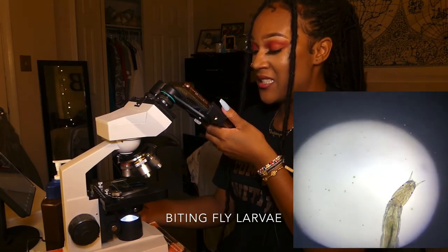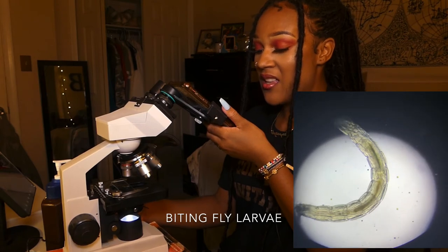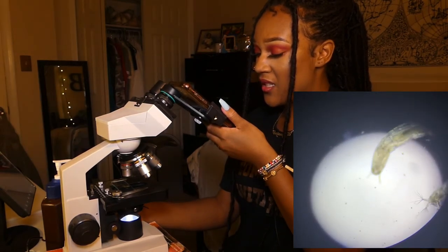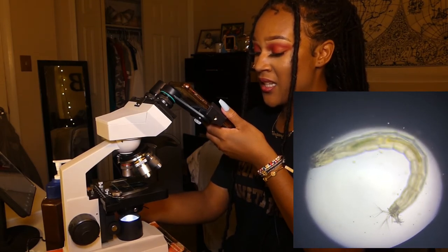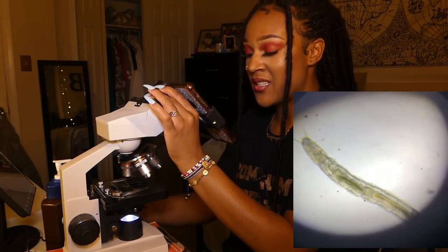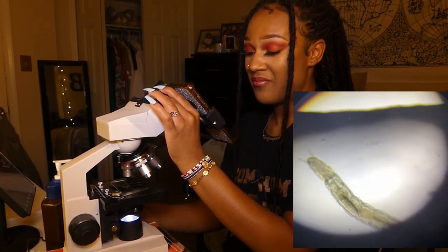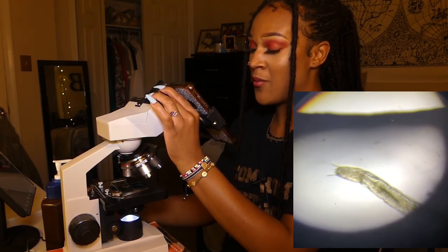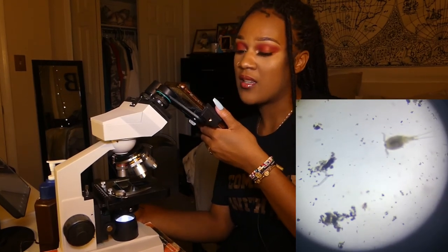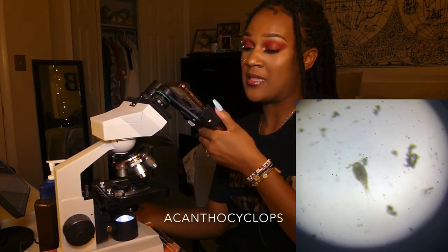Bruh. Oh my goodness. It looks transparent when you look at it on the side, but close up, it looks... Look at the thing on his butt. What does this look like? It just looks like branched hair. But look at it. Did he eat something on the inside? I think that's just the esophagus, but look at it, this is in pond water. So if you want to drink some pond water, just know that Remy is in there. It might sense the light from the microscope, so that's probably why it doesn't want to be seen.